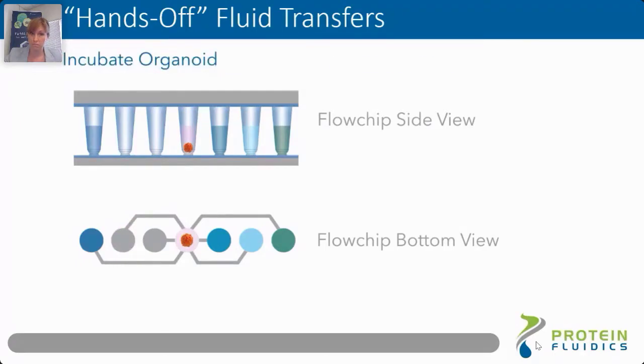Let the sample be treated with the compounds. Then we can collect supernatant back in this well and transfer staining solution. Let our sample stain, remove stains, and do a wash step if needed. Now, at this point, when all the transfers and sample collection is completed, your assay is done, and the plate is ready to use for the downstream analysis.